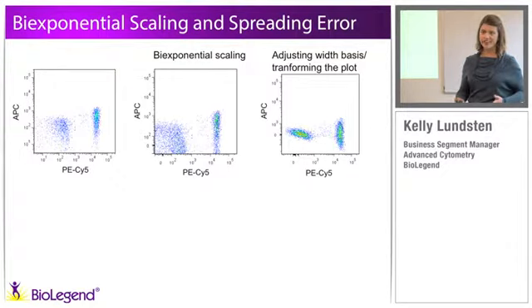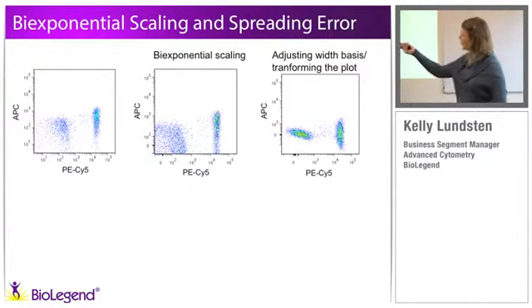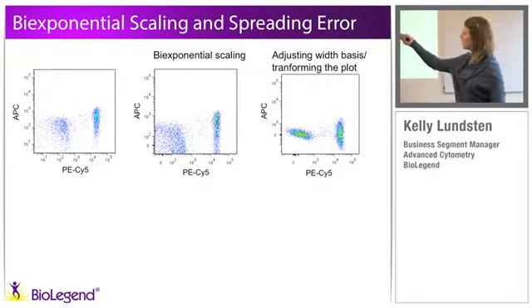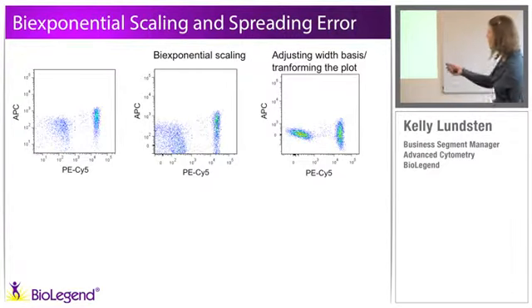There's no other fluorophores on it. It's a single color control. When you're looking at this in just logarithmic scaling, you would look at that and think that that population is not accurately compensated because the core, the center of those MFI positive and negative are not aligned. But this should also indicate to you all of these events that are close to the axis that I'm not visualizing all the information that I've gathered for this marker.